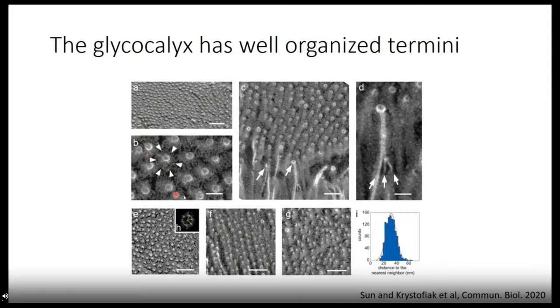The other interesting thing with these termini is they are very resistant to water sublimation during the etching process. And we think this is because they're highly decorated with sugars and kind of hold on to their water very strongly. So freeze-etching allowed us to visualize all these structures that were previously pretty difficult to see or understand. And now we have an idea of how this kind of unique structure on the enterocytes actually functions.